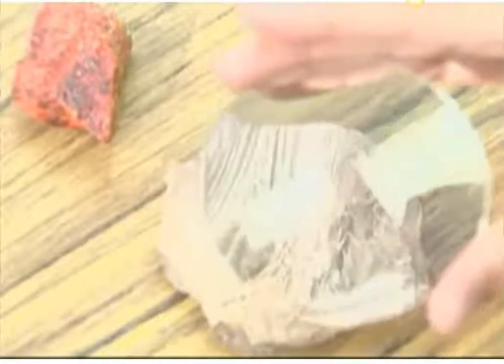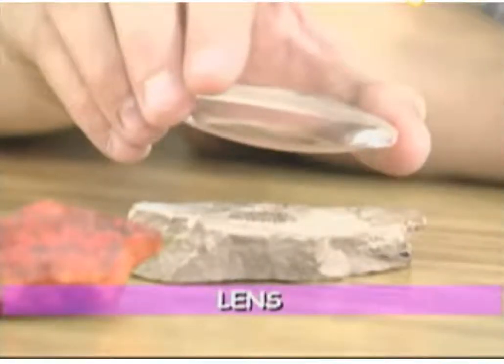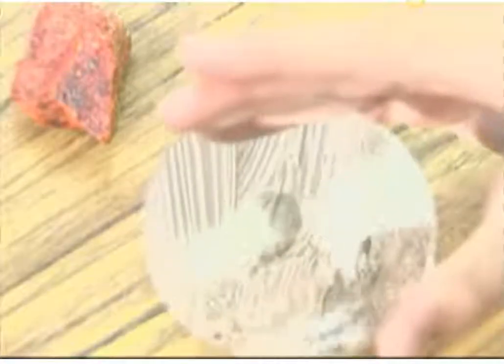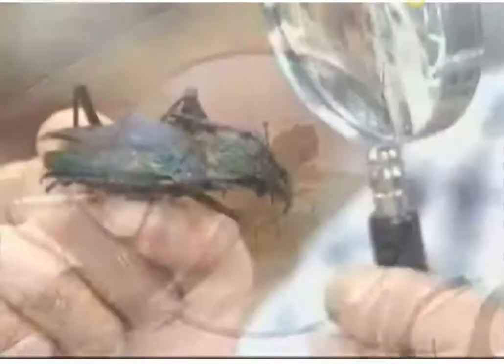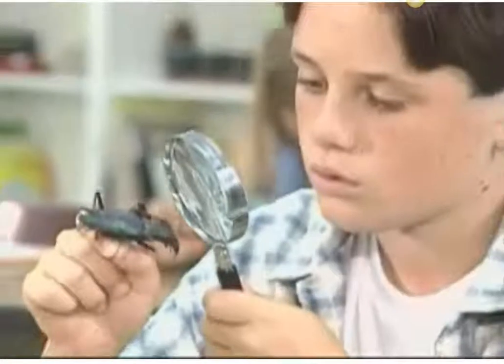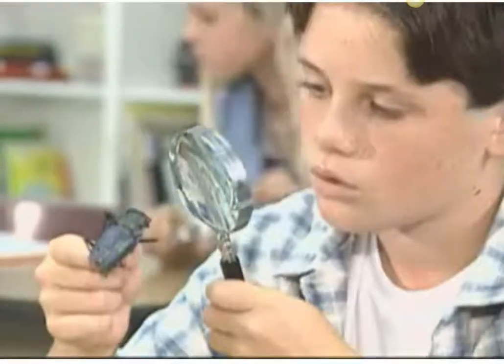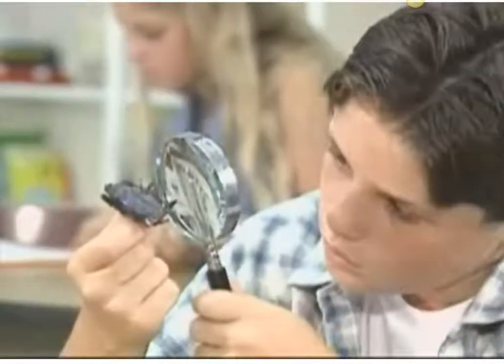Much more practical as a magnifier is a thick piece of glass with curved edges called a lens. It is meant for examining just about anything in which you have an interest. Magnifiers come in a variety of styles. Some have a handle. These are very easy to use, but they usually have less magnification. This one has a magnification of 3.